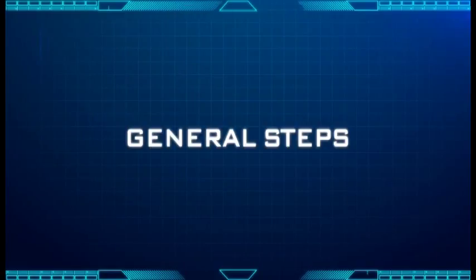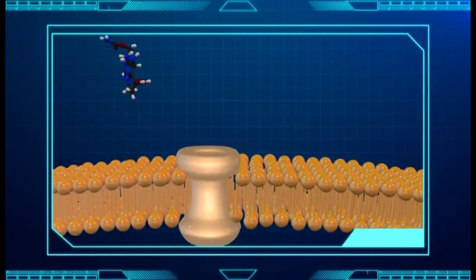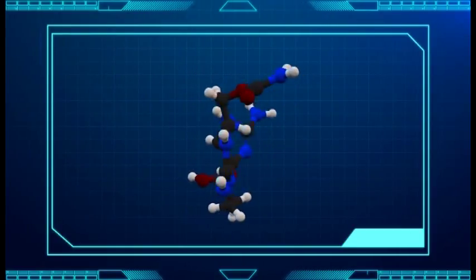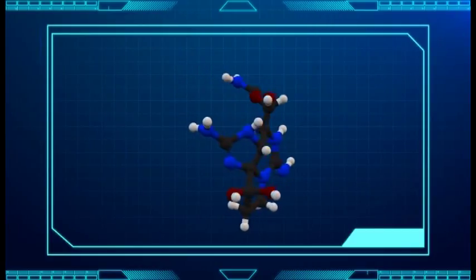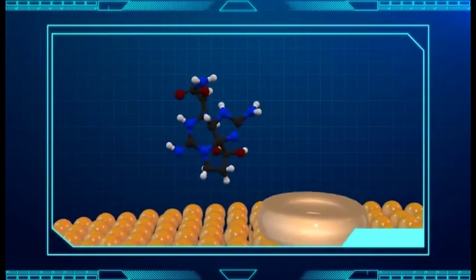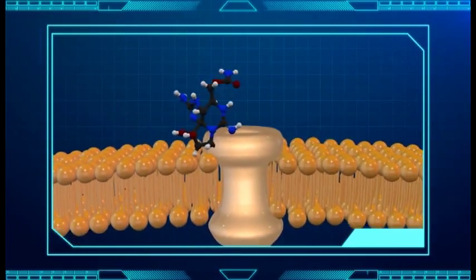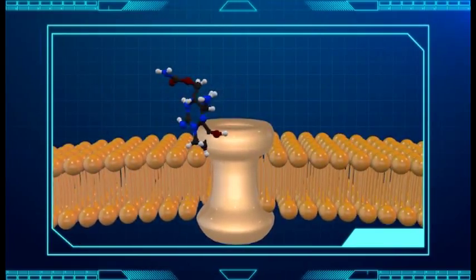General steps. RBA, as applied for PSP toxin detection, is in the form of a competitive radioligand binding assay. A radio-labeled ligand, usually in the form of tritiated saxitoxin, is made to compete with PSP toxins in your sample for binding to the same receptor site in sodium channels.